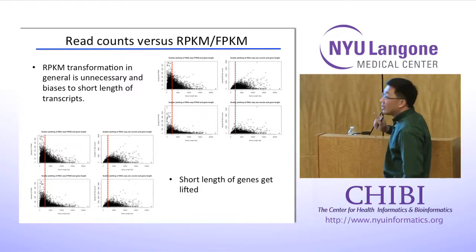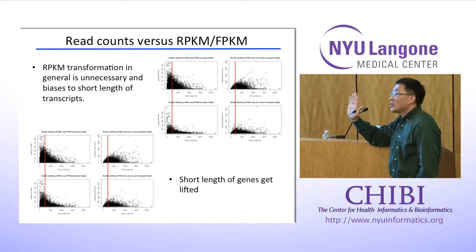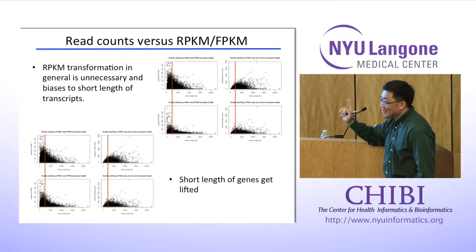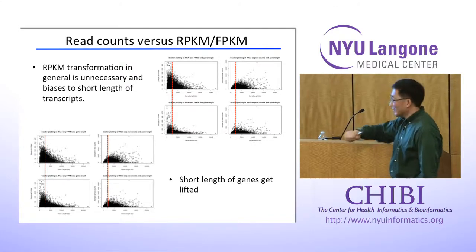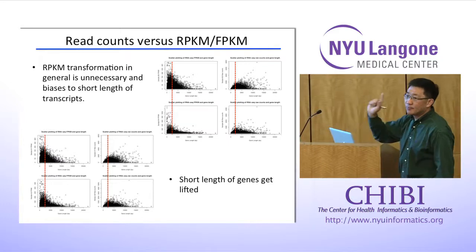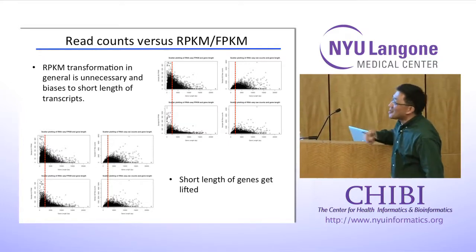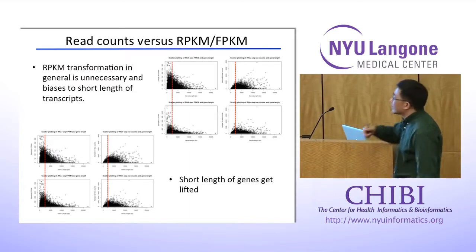I believe this correction is biased toward the short length of genes, but I know this can't really convince you that the gene length adjustment is unnecessary. I will have one more slide later. I believe after that you will agree with me. Gene length correction is unnecessary.